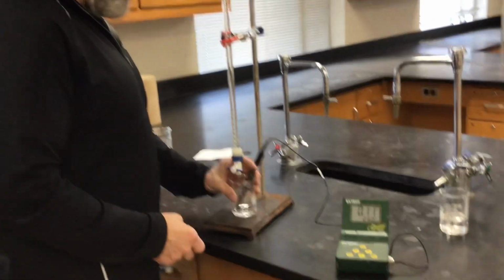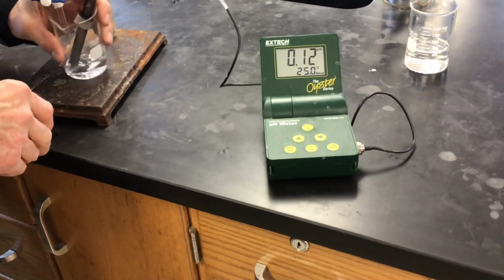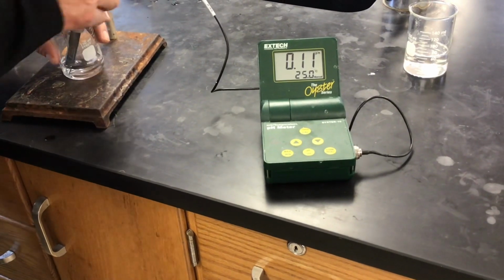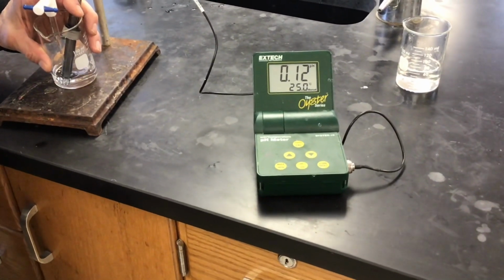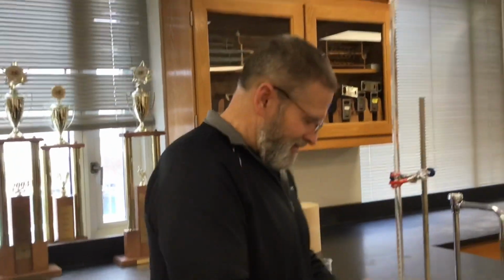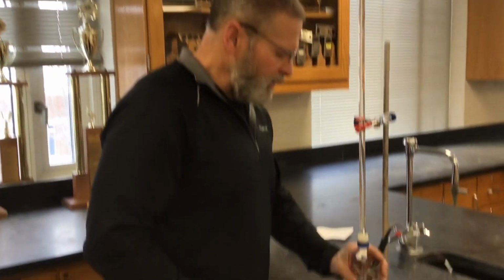Okay, so there's 1 ml added. Swirl here. Are you sure you added any? It doesn't look like it's changing. Let's try again. Well, that's the best scam in the world. We're really just putting water. No, we're just kidding. There is something significant about that. Okay, there's 2 milliliters added.